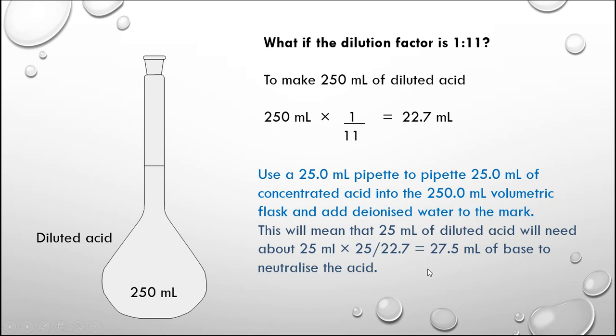So that is how you would do a trial, and you would then make up your diluted solution ready for your titration.